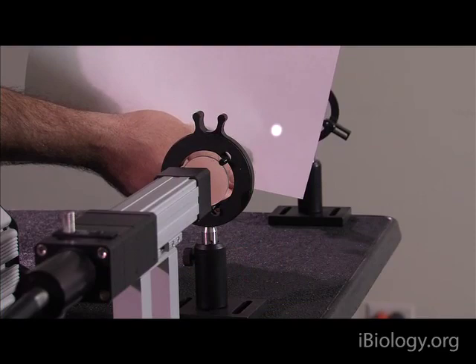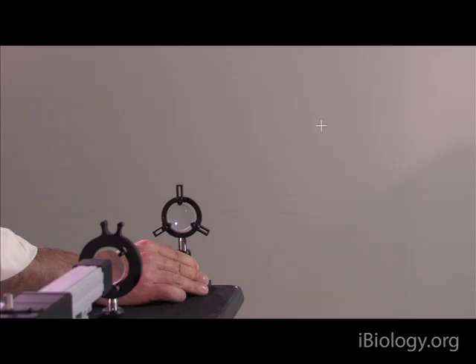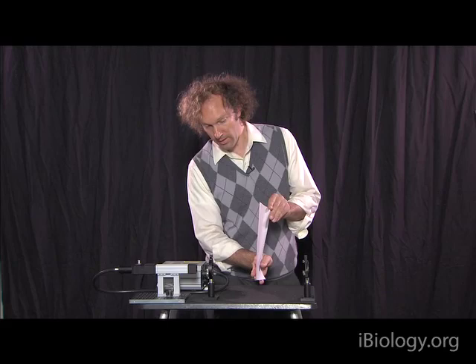I've taken one step to change the size of my cross. This is actually demagnifying a little bit. And this is magnifying. So the size of this cross is substantially smaller than that one. And based on our lens maker's equation, we should be able to determine, based on the focal length of the lens, the separation between the object and the image. We should be able to calculate that. And similarly, we should be able to get the magnification out of those by the ratio of the distances.